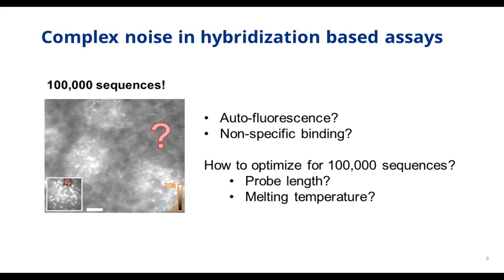Because the binding energy from a long probe will outweigh the thermodynamic penalty from a single mismatch.